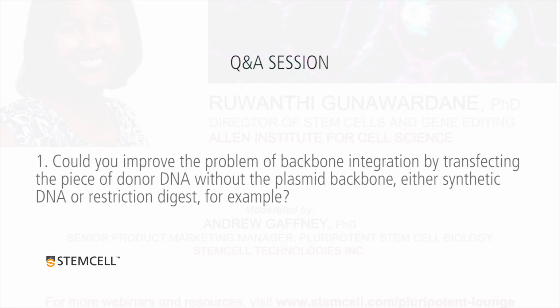What we're trying to do is single-strand DNA. I don't know if most people have heard, but people are now able to make large pieces of single-strand DNA. So we are looking into that because that will, number one, significantly reduce the incorporation rate. It may also reduce the need for 1 kb homology arms. So if we can shorten that, then we can also screen much easier because we don't have to span about 3 kb. But that is something we're actively trying to improve. We just didn't even realize it till we started screening these clones.